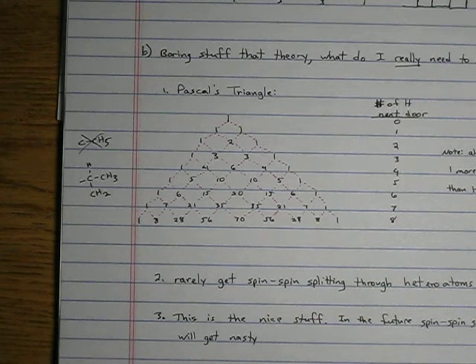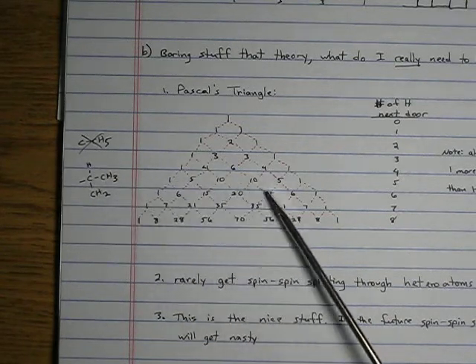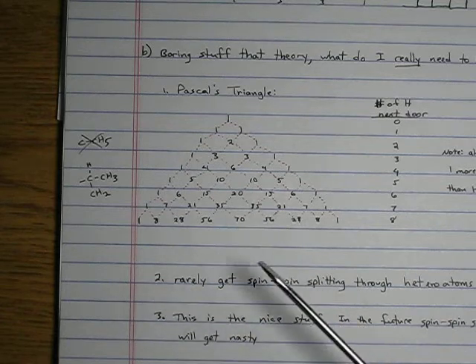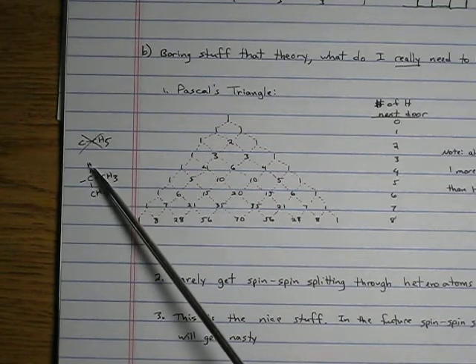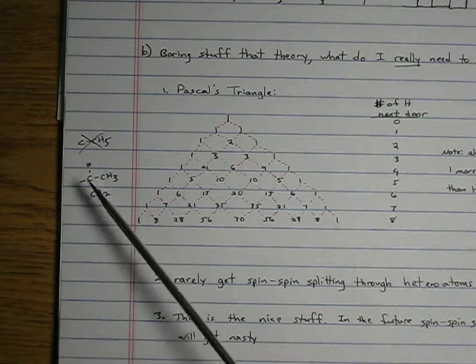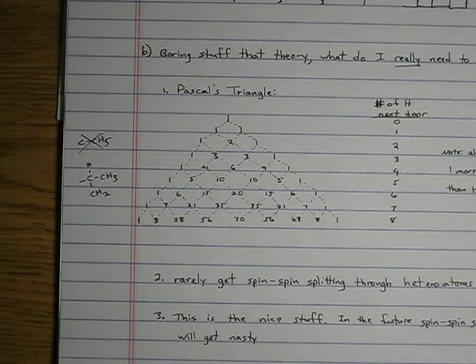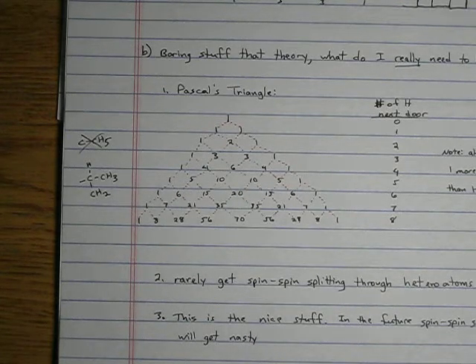All right. And note, this hydrogen will be split into a 1 to 5 to 10 to 10 to 5 to 1 multiplet, but what will it integrate to? Well, we're looking at this 1 hydrogen, so it'll integrate to 1. It was split into a multiplet by these 5 next door, but it's still only 1 hydrogen.